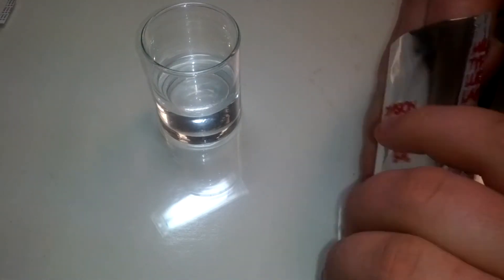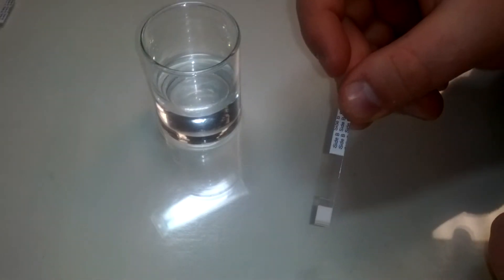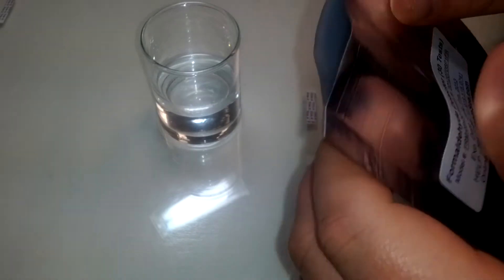Right before you are ready to conduct the test, remove a FRM03 formaldehyde dip detector from the packaging and seal any unused detectors back in the pack it came in.